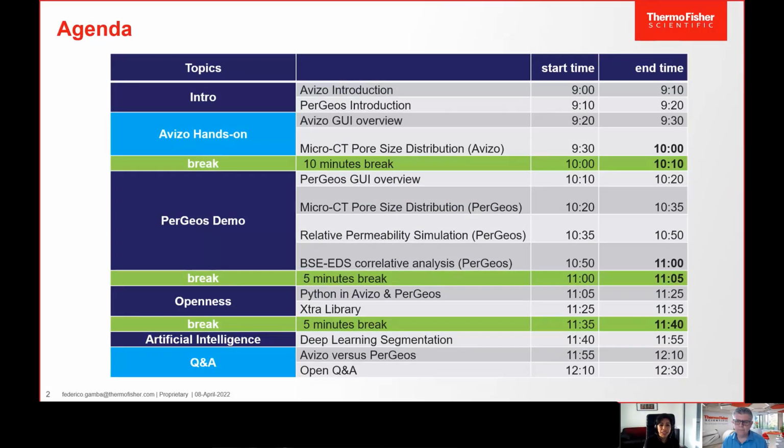So as you can see, this is the agenda of what we will be looking at this morning. We have scheduled some breaks for you to walk around and prepare some coffee if you need it, because it will be a long morning. We have a hands-on part where you will be manipulating the Avizo software.